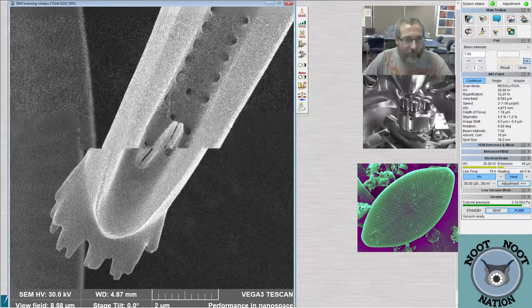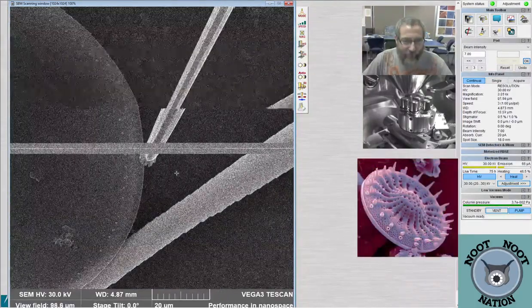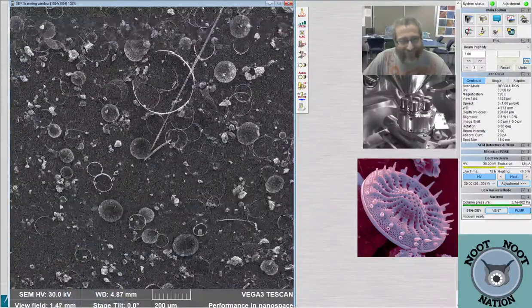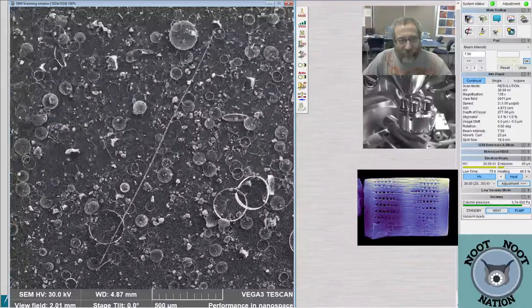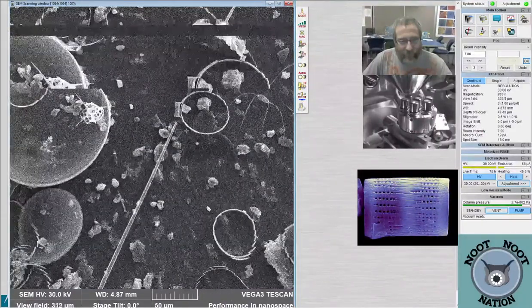It is. We could go visit the other end of it, maybe. Let me zoom out. All right, internally valve end with serrated protrusions and labiate process. It looks like it probably is longissima. Maybe.